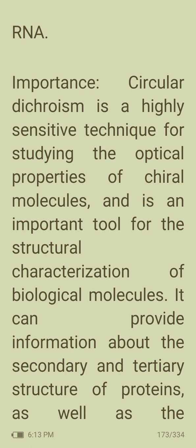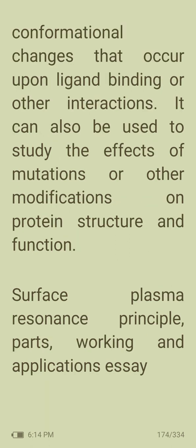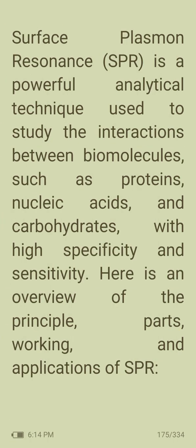Now let's move on to the next topic, that is nothing else but the surface plasmon resonance technique, its principle, parts, working and applications. Surface plasmon resonance is a powerful analytical technique used to study the interactions between biomolecules such as proteins, nucleic acids and carbohydrates with high specificity and sensitivity.